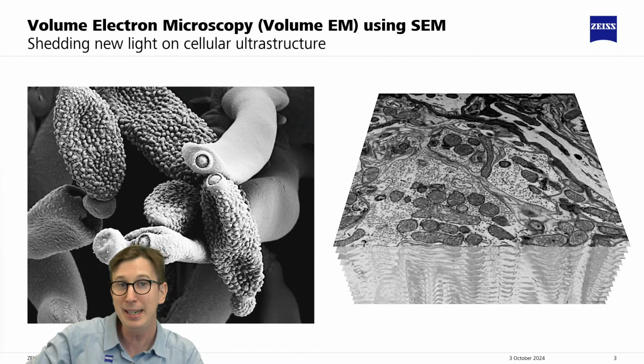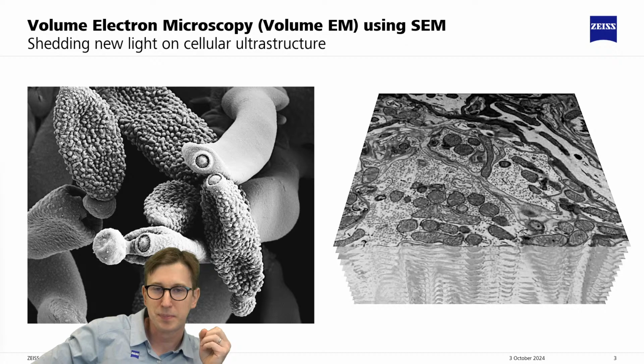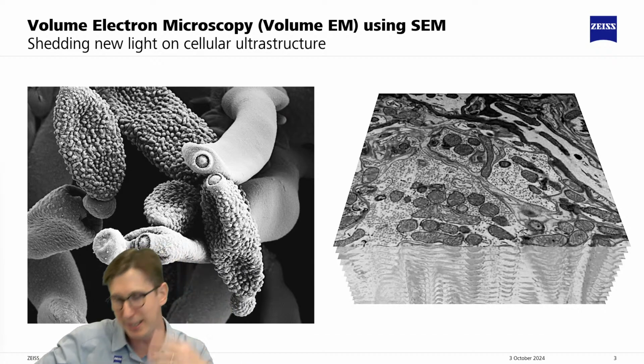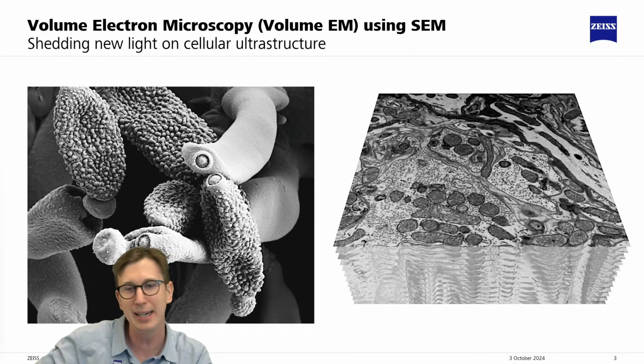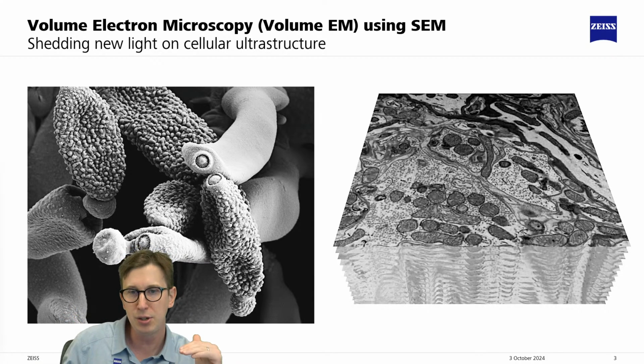And now this technique is very important for doing diagnoses of disease. So this would be with transmission electron microscopes, also scanning electron microscopes. But what happens if you want to see the full volume? Especially when we think about neuroscience and you're trying to understand the brain as a whole, just seeing two-dimensional images isn't going to get you the data you need.